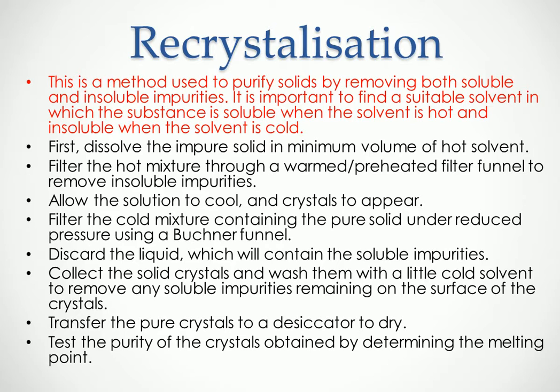We're going to then filter the cold mixture containing the pure solid under reduced pressure using what is called a Buchner funnel. So that's just a type of funnel that we're going to use, and this is really a fast process to filter the mixture. So it's really convenient to do that.